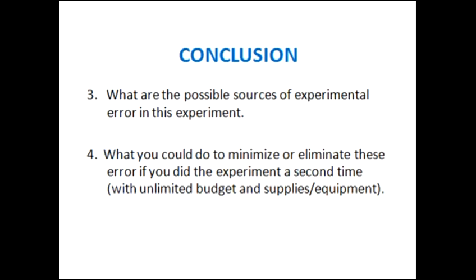Question 4 then asks, what could you do to minimize or eliminate those experimental errors if you could do that experiment a second time and you had unlimited budget and unlimited supplies? Okay, what other ways could you do it to get a better answer?